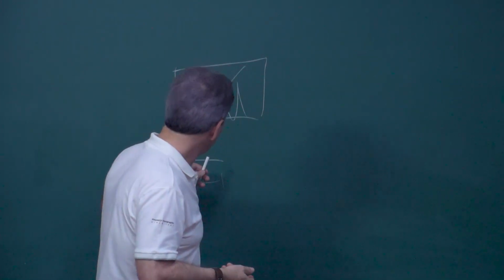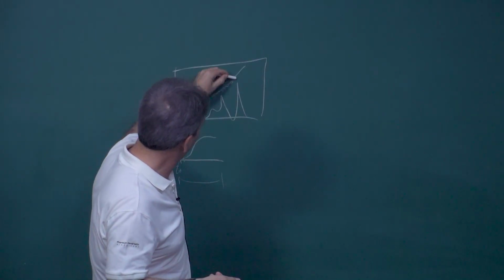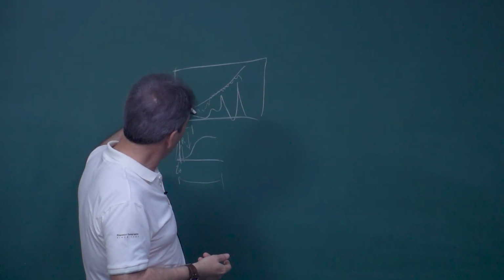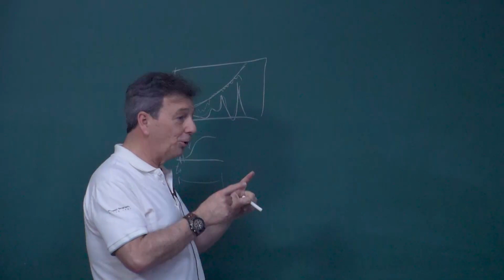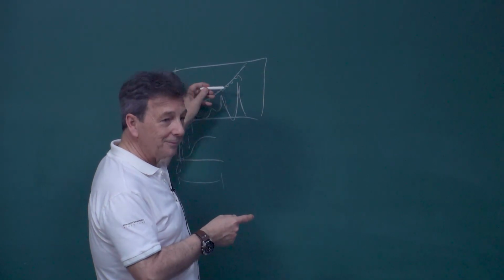One spectrum will look very noisy, and you can hardly know what you have. But because you're doing it 1,000 times in 1 second, even with a very low signal to noise ratio, at the end you will have a clean spectrum, and the fluorescence will be ignored because you are only looking when the Raman comes out, before the fluorescence does.